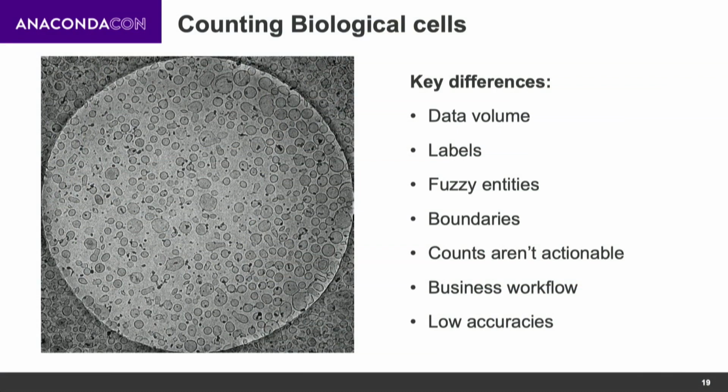So far, we are talking about 10,000 or 100,000 images labeled, and thanks to the volunteers or crowdsourced efforts. Whereas here, we are talking about images which either don't have labels, or in some cases, you have just hundreds of images. So it could be 400 or 500 images which have been manually labeled by the people. Usually people, when they count it, they may not label it painstakingly. So that's the labeling that they would naturally do. Whereas for the model, we'll have to zoom in, place the dots at the exact position, identified by the different shape, and do this many times for different images. So this kind of labeling did not exist.